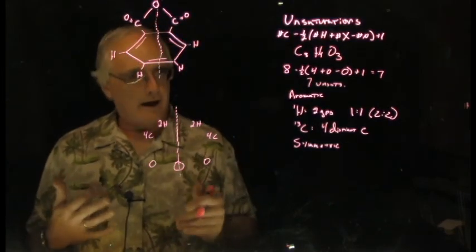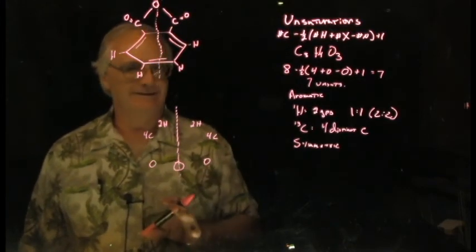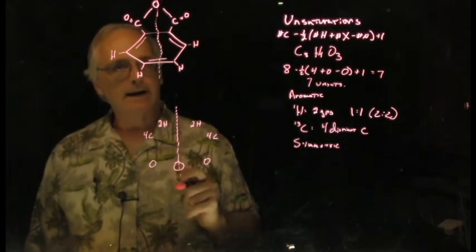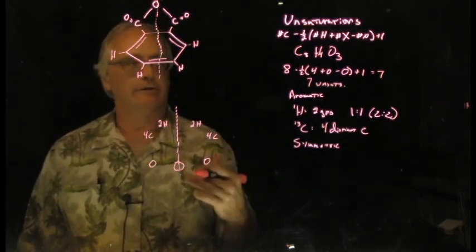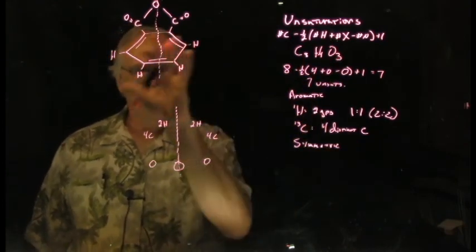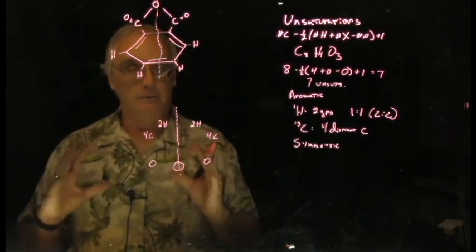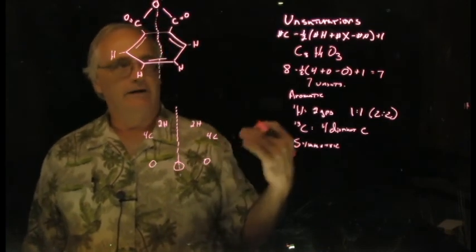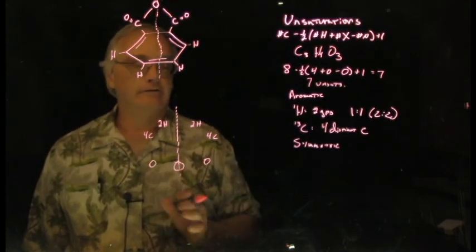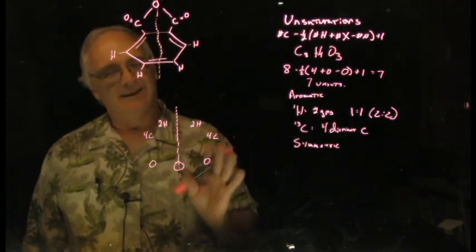3-membered rings are certainly possible, but rare. And so invoking a 3-membered ring is a bit dicey in structures like this. 6-membered rings, 5-membered rings, they're far more common. And so remember all your rules of organic structures while you're doing these. And generally what will happen is as you start looking at this information, start sketching out little pieces like this, suddenly one structure and one structure only, boom, will snap together, and you'll realize that it matches all the criteria present. To be honest with you, the first 100 structure solving problems that you do are the toughest. It gets easier after that. I'm slightly exaggerating, but not really.